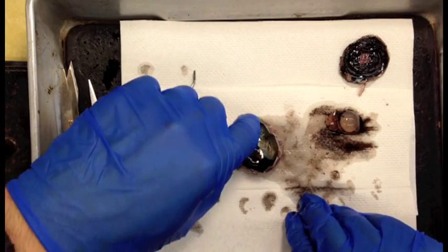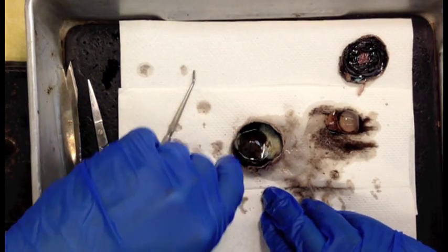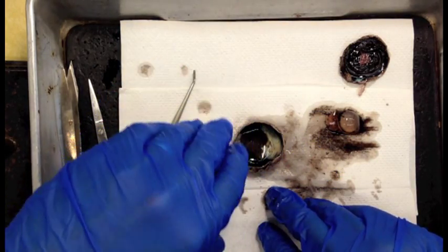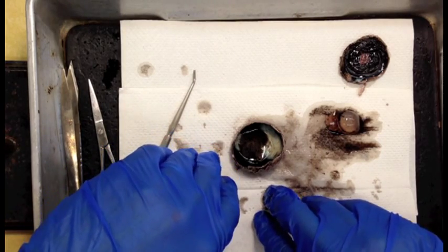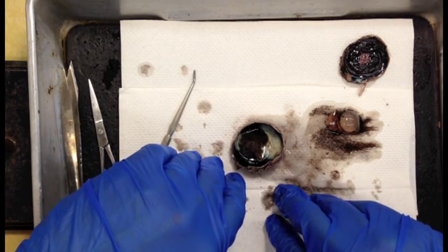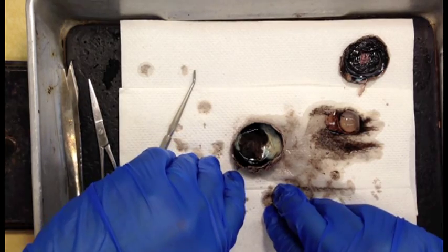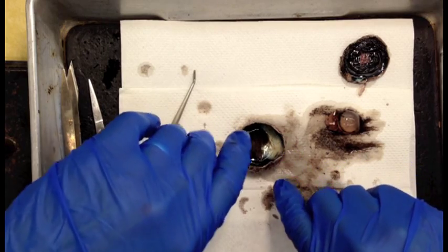Another point to show you is the dark color that's in here, lining the inside of the chamber. This is the choroid. And in our eyes, it's a complete dark pigmented layer. And what this does is it attenuates any light that actually passes through the retina and does not reach a photoreceptor. So if any light passes the photoreceptors, you don't want them to bounce off and potentially hit another photoreceptor. That'll provide for blurry vision.